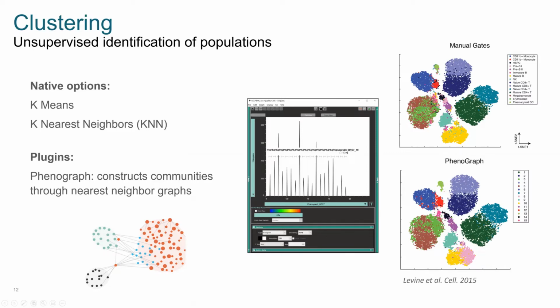But if the authors take that same data and just manually, through their own knowledge, gate populations in that sample they know exist, you can see that they find roughly the same number, and they can find populations that correspond to an unsupervised identified cluster down here, right? So they can find this population manually, which they identify as a mature B cell just from their own immune knowledge and from the marker profiles.